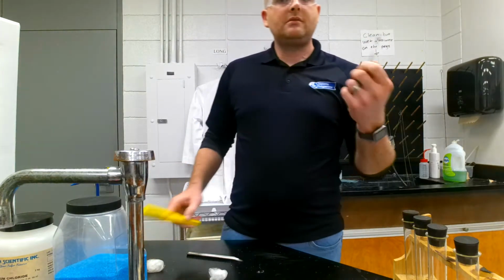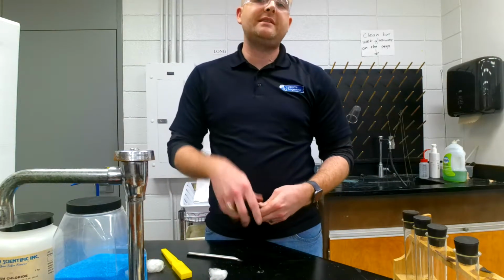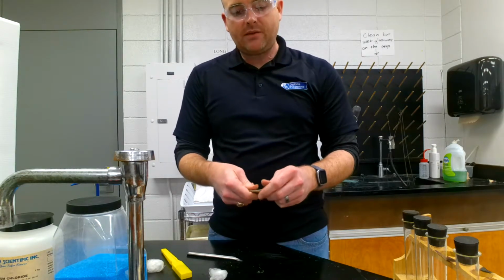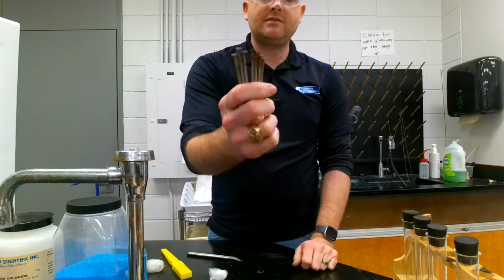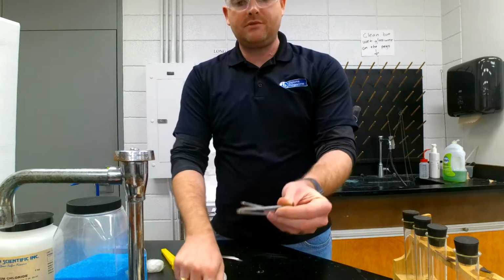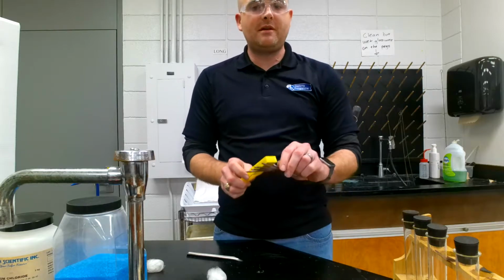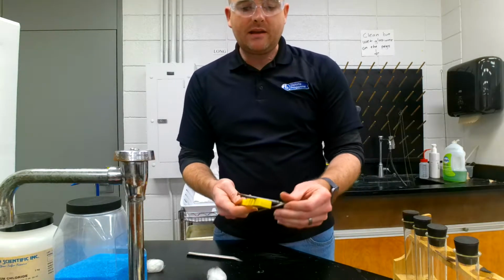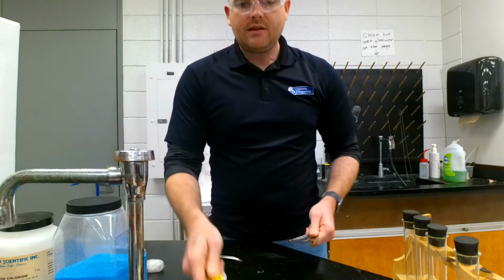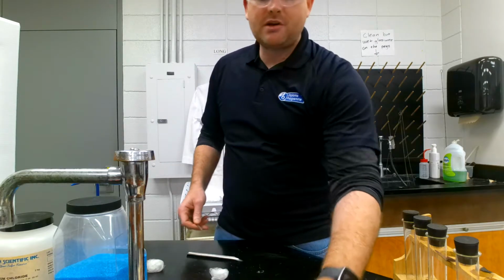Your typical nails that you get from the hardware store are galvanized, which means that they have zinc plated around them. So this won't work exactly, but if you get one of those cheap old rusty nails like you see here, I have actually scratched the rust off of them, so I've got iron in them, and you can see they are magnetic, so they do have iron. Anything that is magnetic like this is either iron, cobalt, or nickel. So pretty good bet that these are iron.